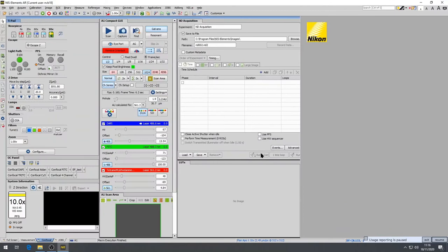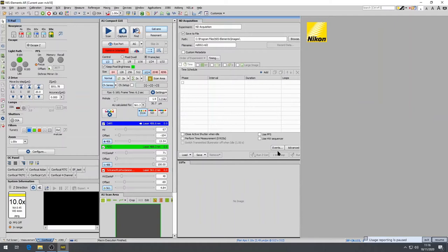Note that the previous user's confocal settings may be preserved. If the layout looks unfamiliar many of the menus can be accessed by right-clicking on the background and that will open up acquisition windows. If you are unsure how to do these and how to reach all these windows, please ask a member of staff.